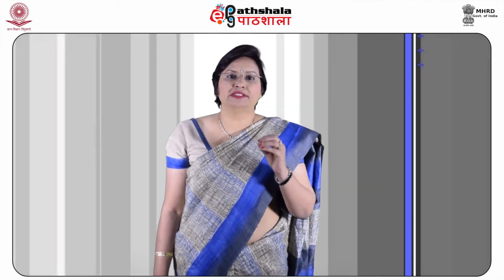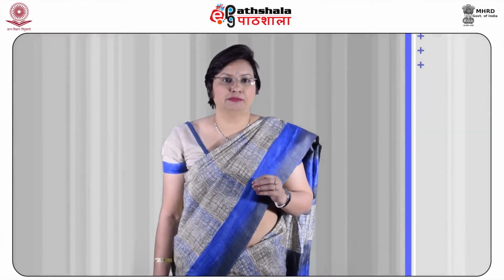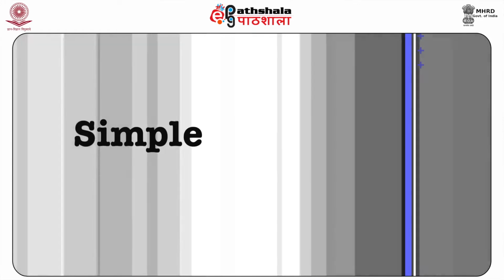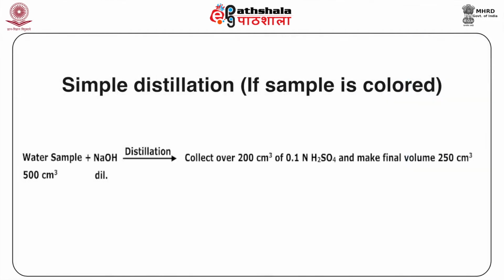Distillation of the sample is required to eliminate interfering agents present in the sample when the sample is colored and when the titrimetric method is being used. Talking about simple distillation, if the sample is colored, the distillation of the colored water sample is done.